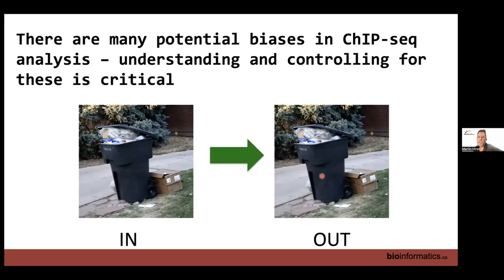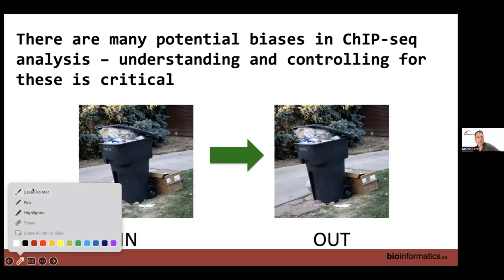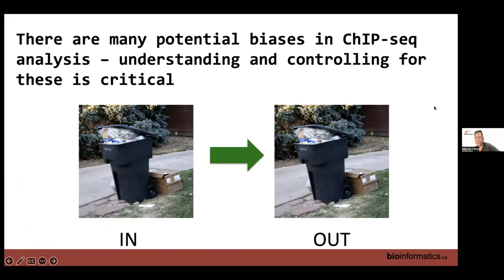Okay, there are many potential biases in ChIP-seq analysis, and understanding these is critical for performing ChIP-seq analysis. So really, it's the adage of garbage in, garbage out. You need to know what the material is going into the sequencer, because that material is going to influence the output.